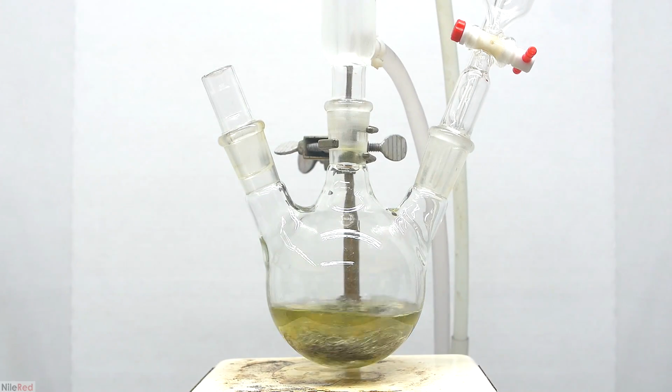I decided to be lazy, so I just dumped in 0.2 more grams of iodine and turned the stirring to maximum. We start to see some ether dripping down from the condenser, and this is a good sign that the reaction has started. The yellow color of the solution that was due to the iodine also disappears, which indicates that it has been associated with the magnesium and it's doing its job.